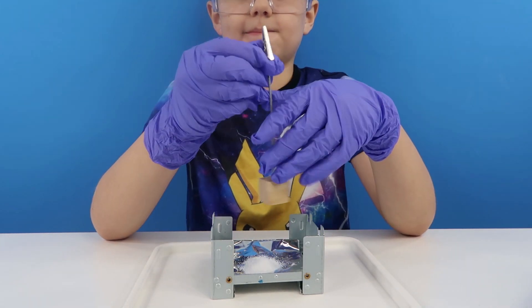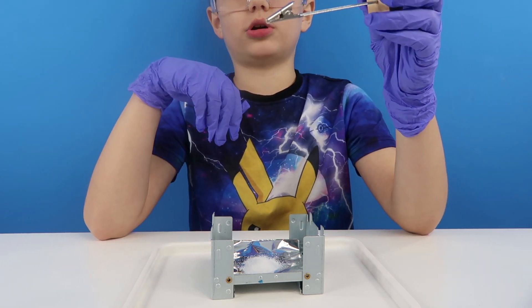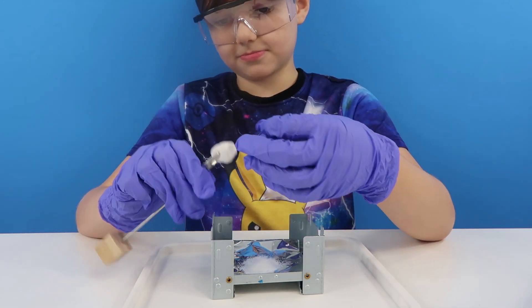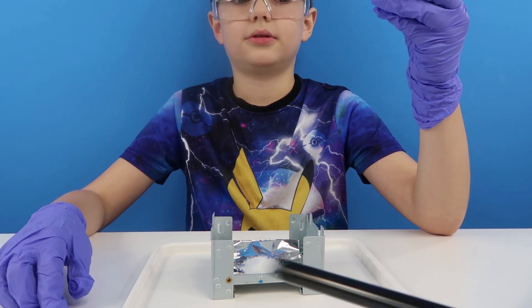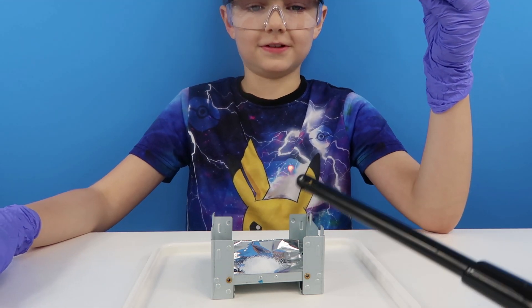Now we're going to pop a piece of marble — oh, this looks like an alligator wire. It does look like an alligator wire, yeah. So now it says that we need to light a splint, but I've actually been clever and I've got one of these cool lighters that will light from afar.